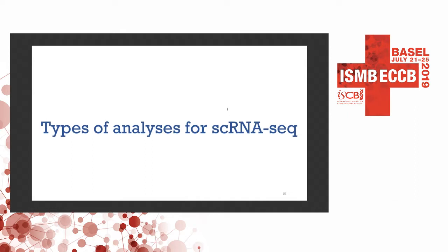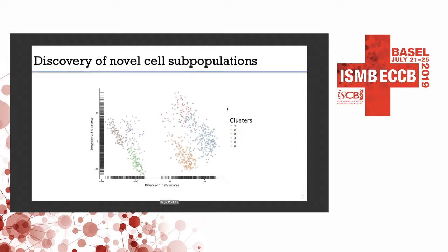Okay. So before I go into the different technologies and pre-processing, I like to give a broad overview of the different types of analyses that we do with single-cell RNA-seq to kind of get you excited and motivated. So the first thing many people are interested in doing is discovery of novel cell subpopulations.